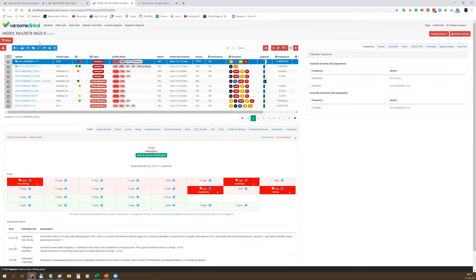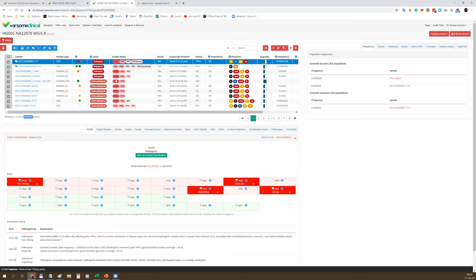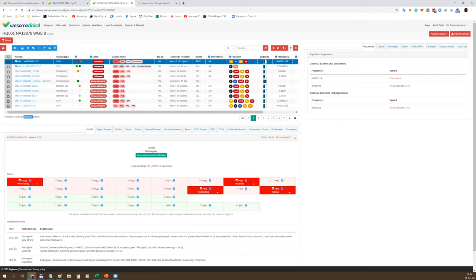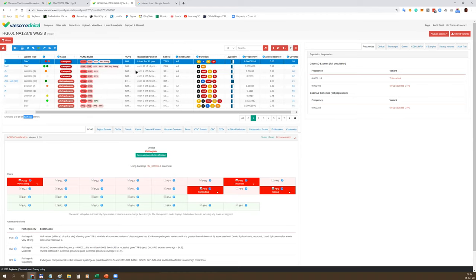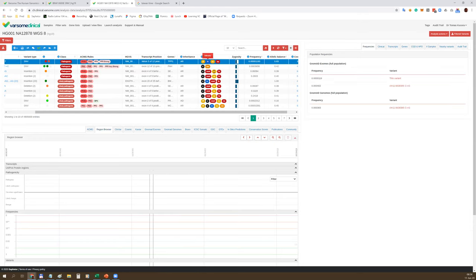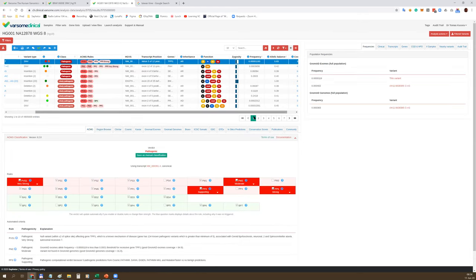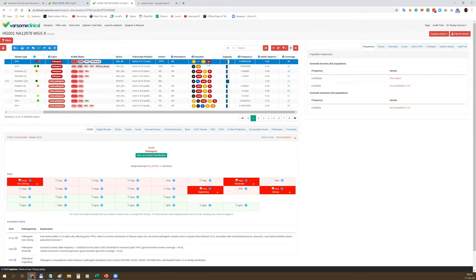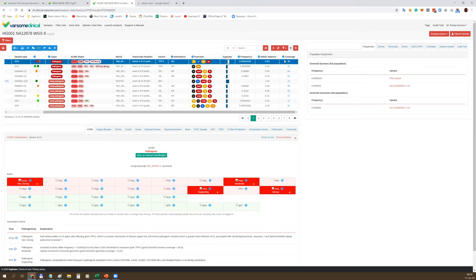Then you can start with the analysis. Once the analysis is fully executed, you will get the results in the form of the variant table. Here we can see an example of a whole genome with almost 5 million variants. Variants are sorted by pathogenicity according to the ACMG guidelines. For every single variant, you can see the variant type, ACMG classification, ACMG rules, HGVS term, the transcript, gene, inheritance, function.